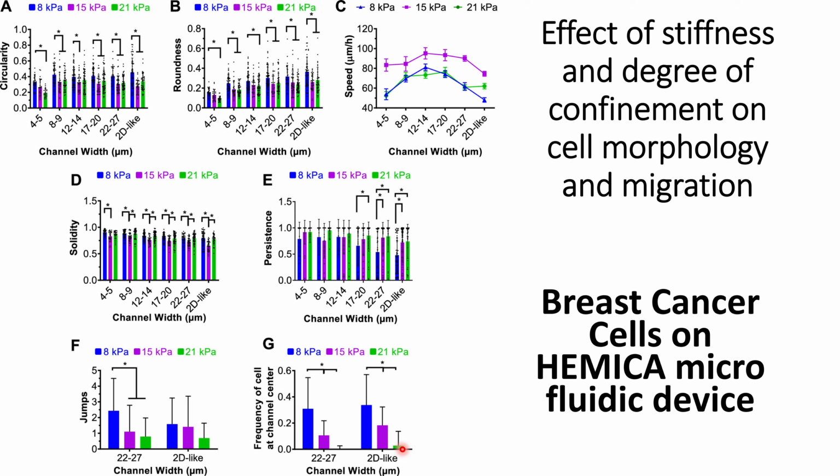And at a high stiffness, we can see very few cells get disrupted from the channel center. So this indicates that with higher stiffness, the cells are most likely to follow a guided path compared to the low stiffness of the gel.